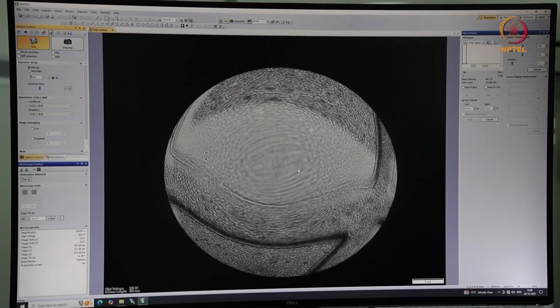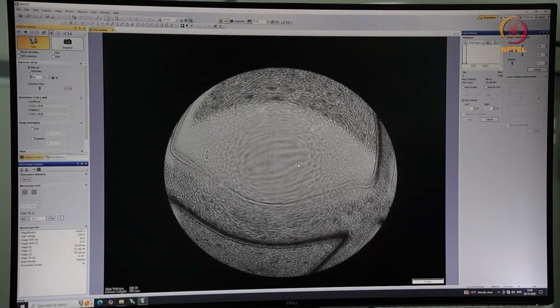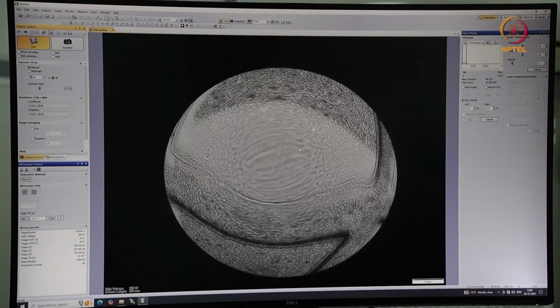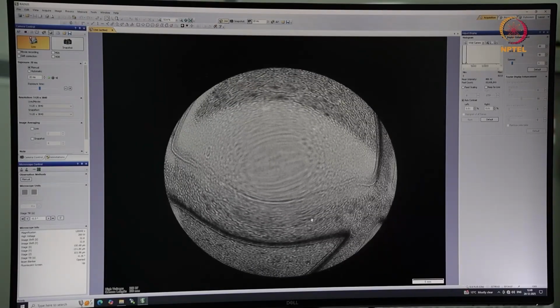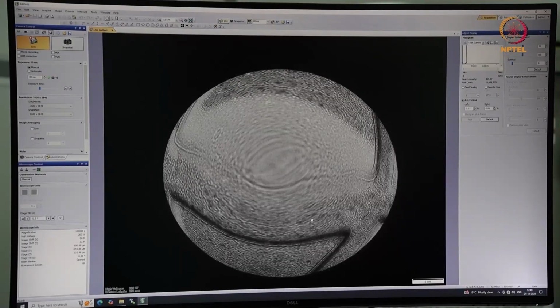So to obtain this image, you should have a trade-off between the correct camera length. You should be able to display this onto your CCD camera and tune the exposure time. Bear in mind that when you're focusing the beam to a cone, this is like you're imaging in the diffraction mode again. So keep the exposure times as low as possible. Here I've put it as 20 millisecond now. And I'll click the condenser lens stigmation button now. And I'll tune the stigmator to make it as circular as I can.